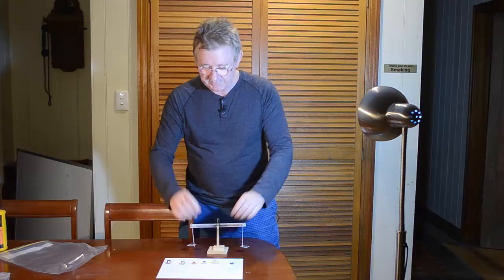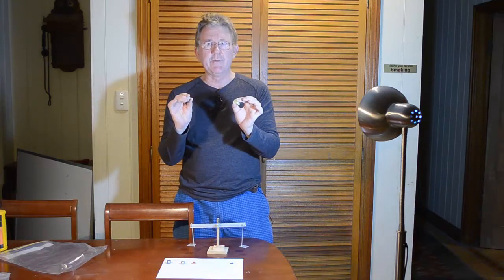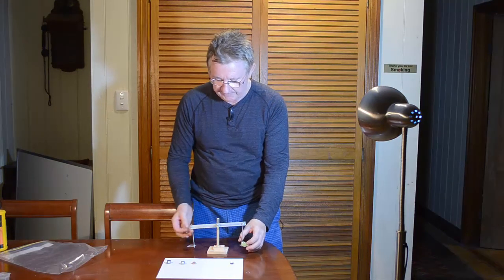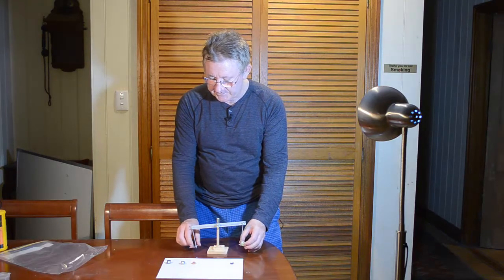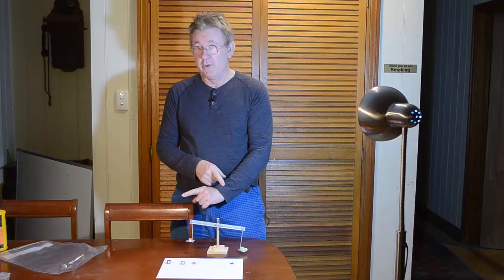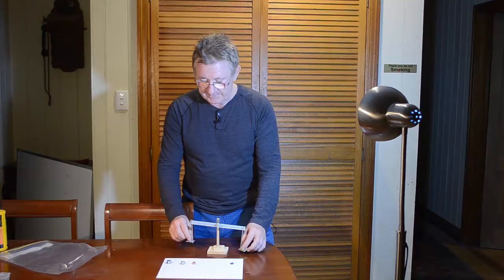Okay, the next pair would be sulphur and aluminium. This is the 2, remember I said, were pretty close in weight to each other. So we'll just hold the shaft there, put the sulphur, put the aluminium there, and see which one is heavier. The sulphur is heavier than the aluminium, not the other way around. So now they can correct their answer.